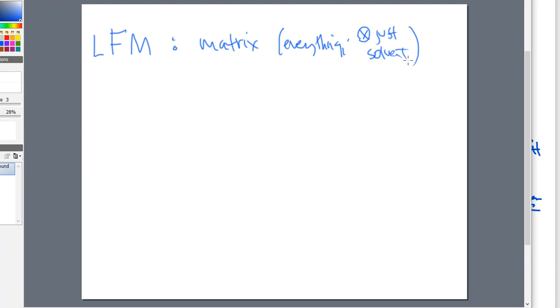That means we understand that a lot of times the samples bring to the picture all of the other things that we don't want to look at, that we don't want to report, but they're there along for the ride. And that's okay as long as you don't get in the way. That's okay as long as you don't interfere with the signal of what we're actually trying to look for.